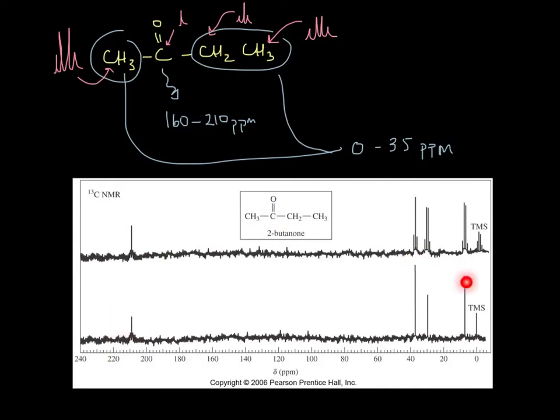Whether they're short or tall, the integrals are no good, and the splitting with carbons is no good. So really all we have to go by is how many environments there are, and the only other thing we have to worry about is the chemical shift, or where they're going to show up.